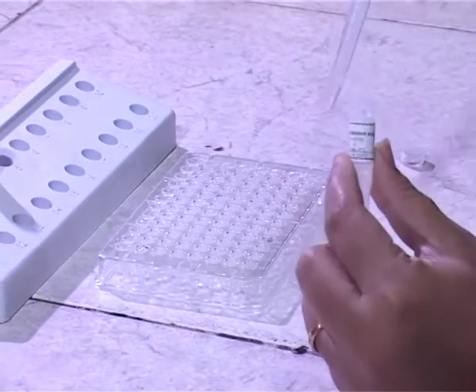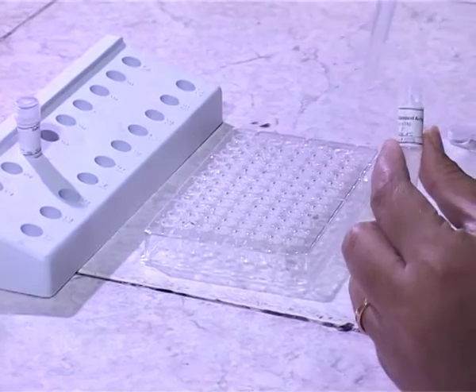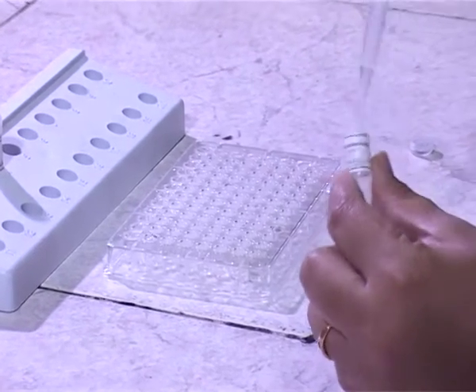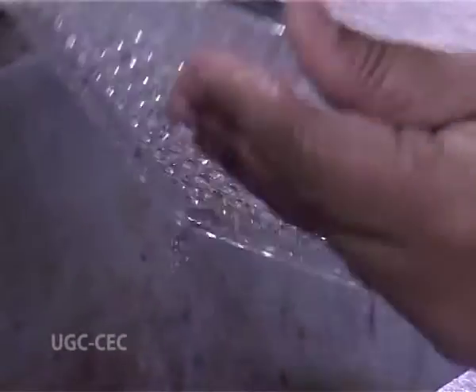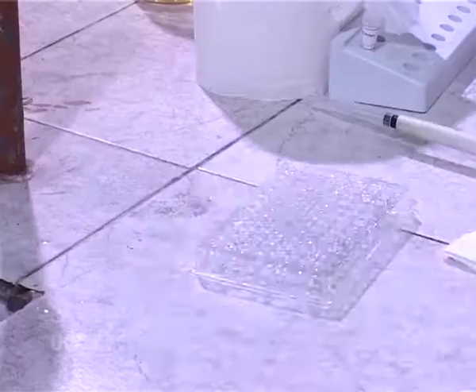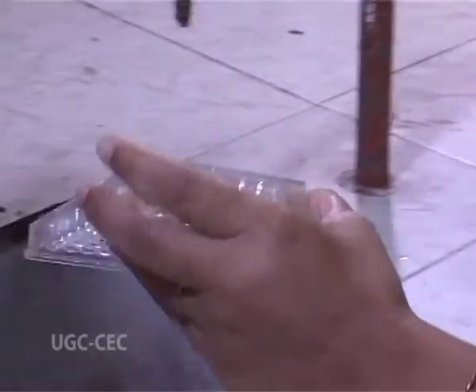First we have to add the antigen in a microtiter plate. Then we have to wash the wells properly to eliminate all the excess antigen. In the next step we will add the sample. If the sample is carrying specific antibodies against this antigen, they will bind to the antigen.